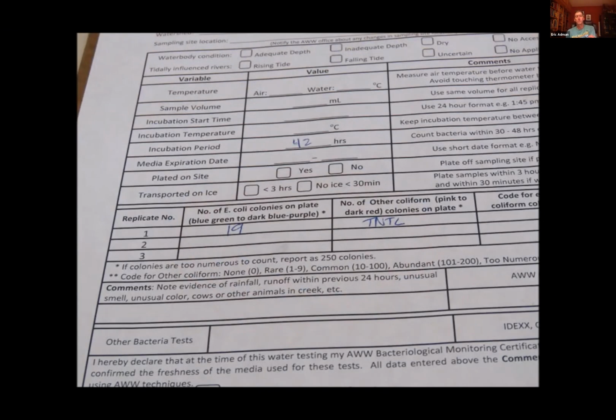The bacterial concentration in 100 milliliters will automatically be calculated in the Alabama Water Watch database. To calculate the bacterial concentration by hand, divide the number of E. coli colonies counted by the sample volume, then multiply by 100.